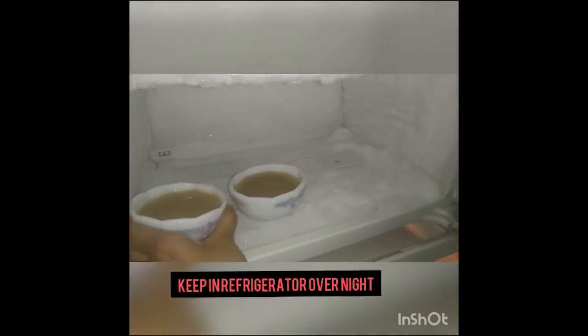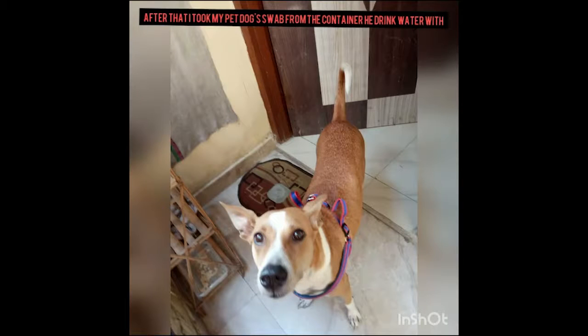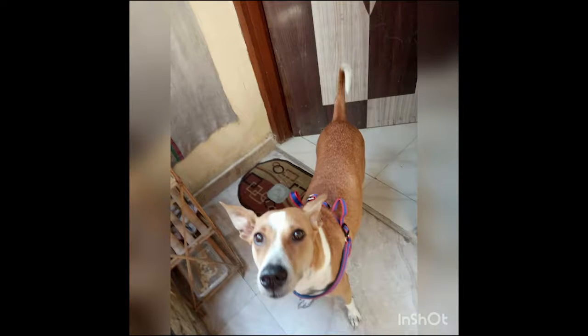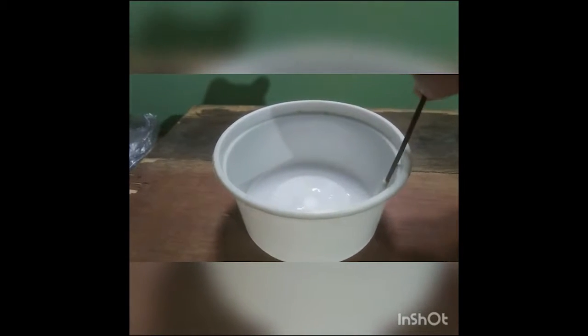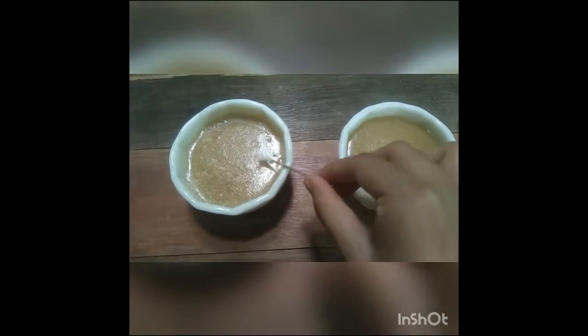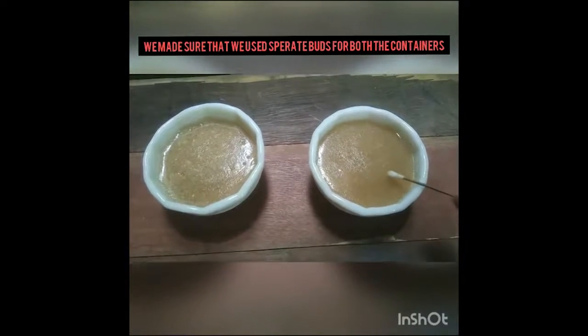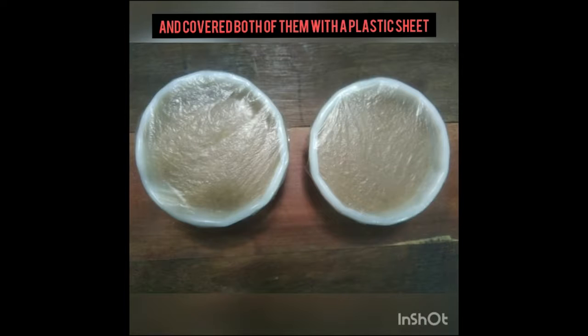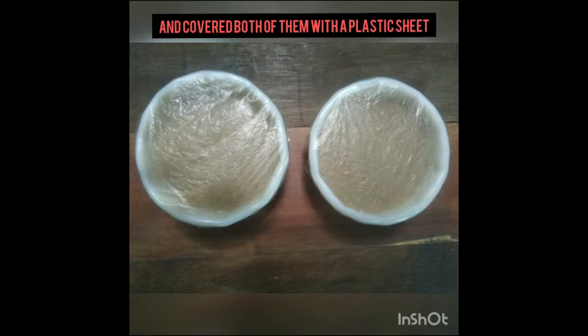Keep both containers in the refrigerator overnight so that the mixture sets up properly. After that, I took a swab from the container my dog drinks water with. I took the cotton bud and gently rubbed it on the walls of the container, then gently placed it on the mixture. Make sure to use separate buds for both containers. Cover both of them with a plastic sheet and keep them near the inverter so that the culture grows.